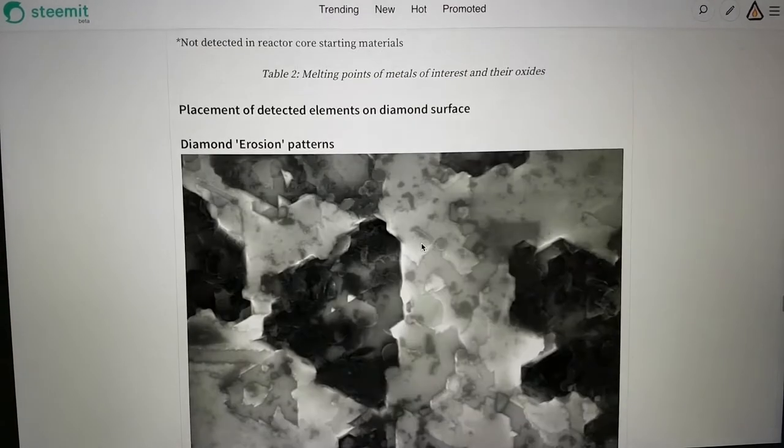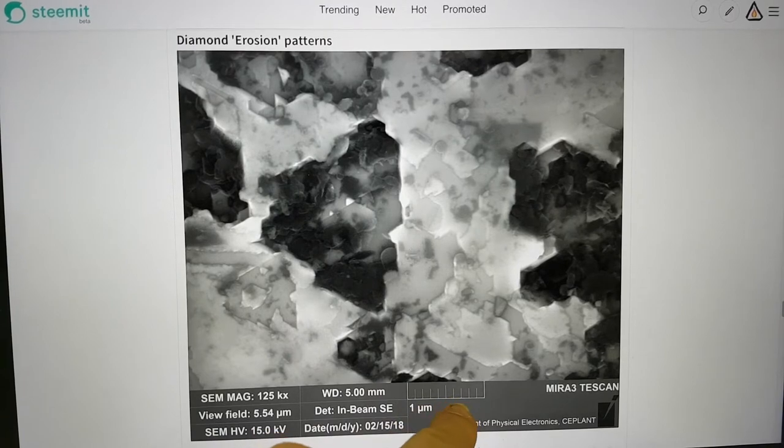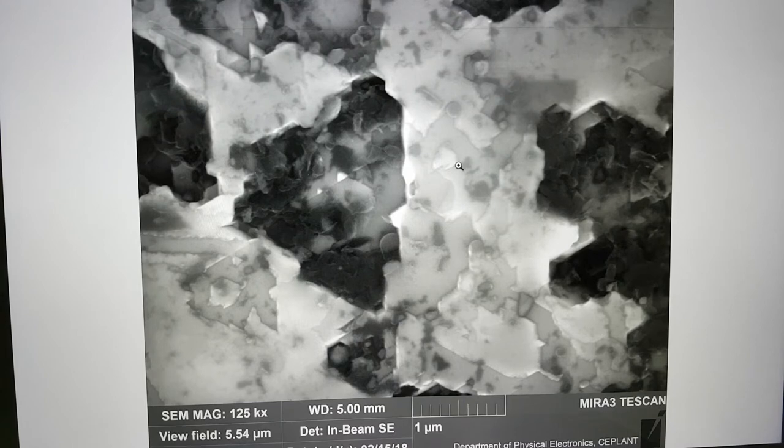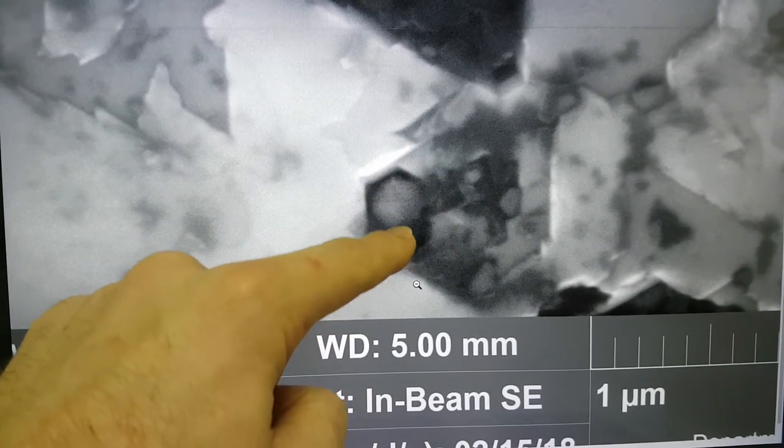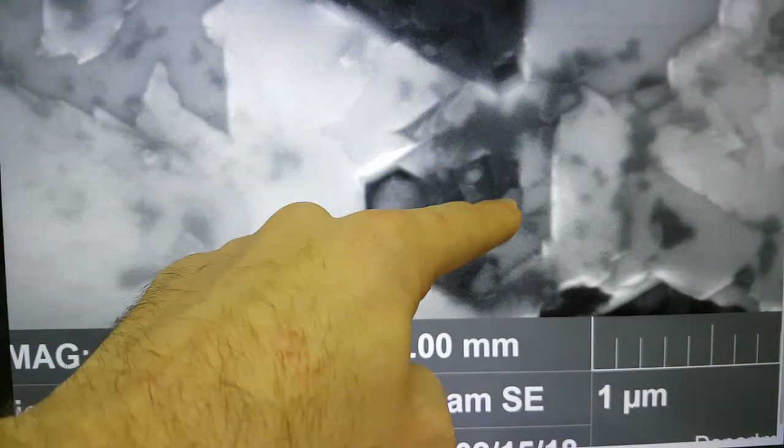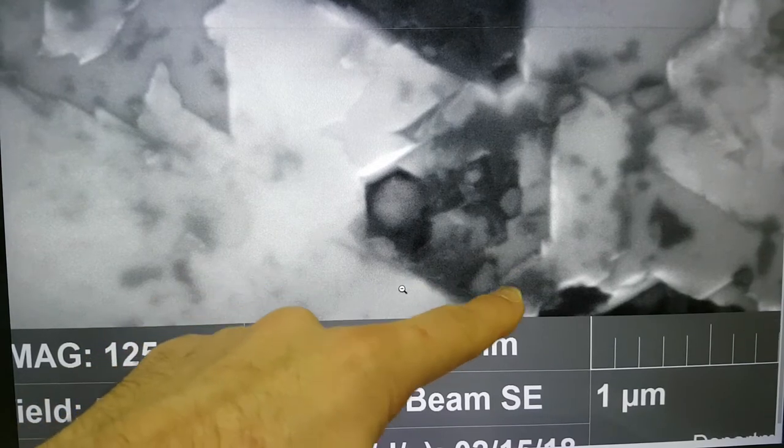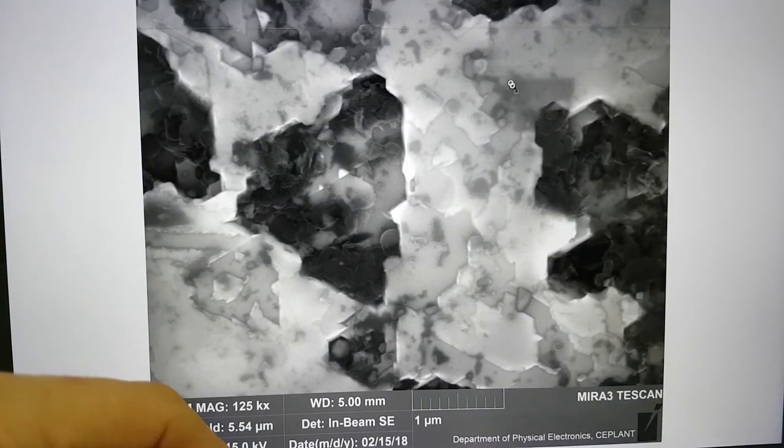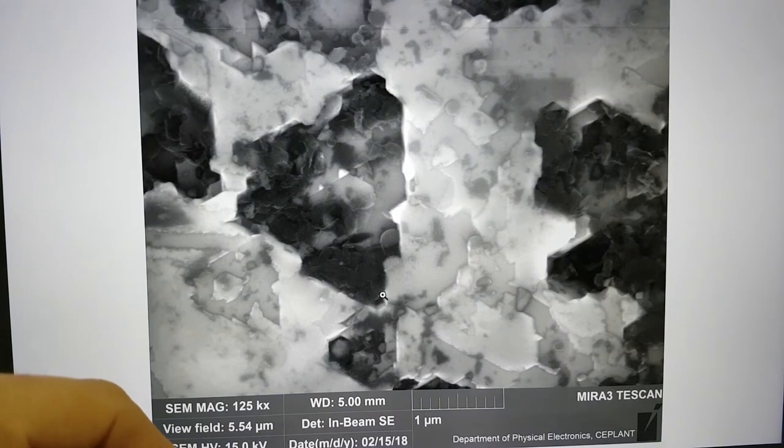Then we come to the diamond erosion patterns and this is where it becomes really fascinating. We're in at 125,000 times here, just one micron on this scale. What struck me here, the first feature is this one. We have what looks ostensibly like a sphere and it's in a hexagon shaped cavity. What is going on that allows this to happen? Here we have a triangular shaped cavity with a sphere in the center. Here another triangular cavity with a blob that's offset and slightly in a triangle.